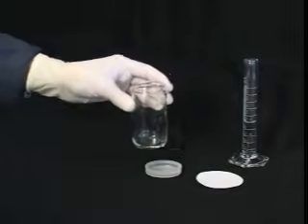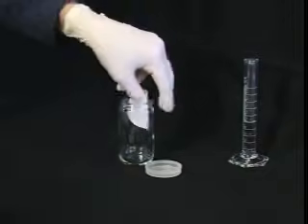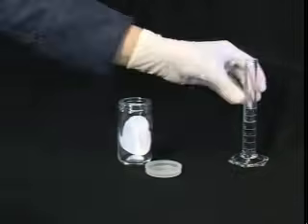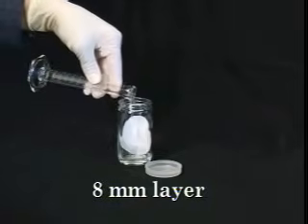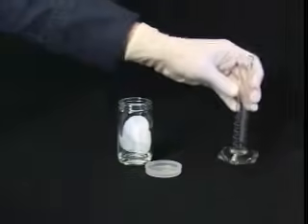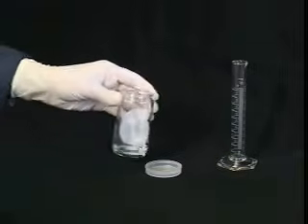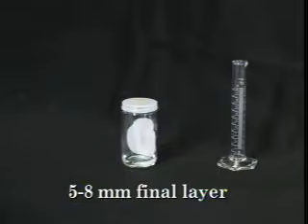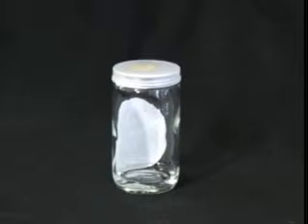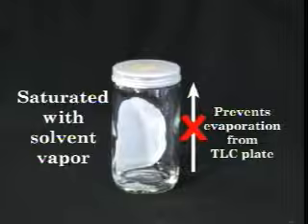Assembling the developing chamber is very straightforward. First, slide the filter paper into the jar so that it is flat against the wall. Next, pour an approximately 8-millimeter layer of the appropriate developing solvent into the jar. Tilt the jar to moisten the filter paper and close the lid to prevent evaporation. You should end up with a layer of solvent no more than 5 to 8 millimeters deep. The moist filter paper ensures that the air in the chamber is saturated with solvent vapor, preventing evaporation of solvent from the TLC plate during development.